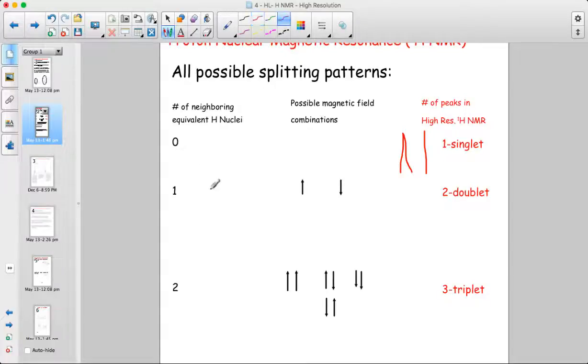Now, if you are a hydrogen on a carbon, and that's next to a carbon that has one hydrogen. Okay, so to try to clarify, let's say we're looking at a peak for this hydrogen, or for a group of equivalent hydrogens, and on the neighboring carbon atom there is just one hydrogen. There's some other carbon chain here, and it could be that we're talking about a chemical environment that has three hydrogens in it.